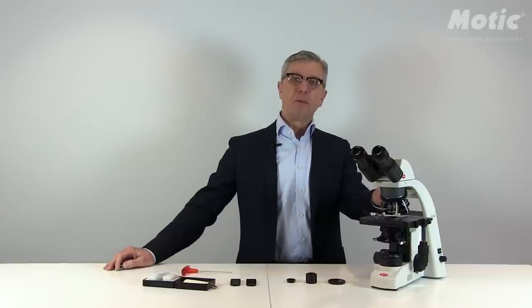Hello, this is Hans-Jürgen Clemens again speaking from MOTIC about polarization contrast on our upright microscope models BA210, BA310 and BA410, respectively the elite versions of these models.